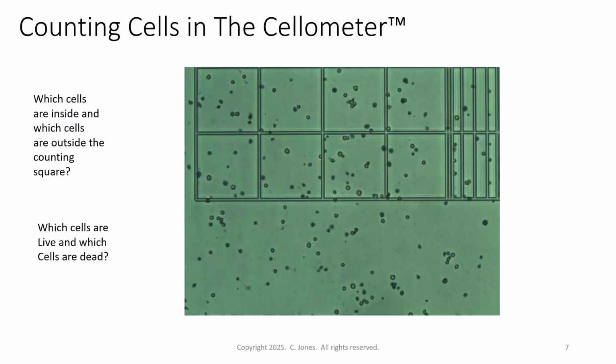Okay, so here is a picture of a cellometer with real cells in it. I had trouble moving it into the field of view. This was the best image I could get. So this is not a complete large square. You see there are only 8 of the 16 squares here. But this was the best I could do. Sorry guys, but at least it allows you to see real cells. These are SF9 insect cells in a hemocytometer.